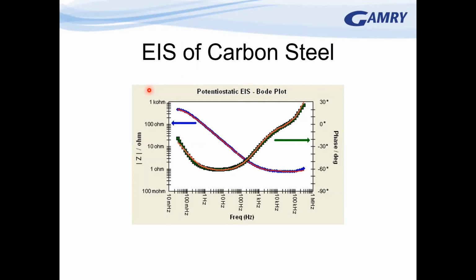Here's a more general question. Okay, so we can obviously get Tafel constants by EFM. Is there another general technique that you could use to measure Tafel constants? The other way to do it is the Tafel plot. But to do that, you need to scan the potential over a wide potential range, which is now not a non-destructive technique. You can make the measurement once, then the only way to do it again is to re-prepare your surface to get it again.